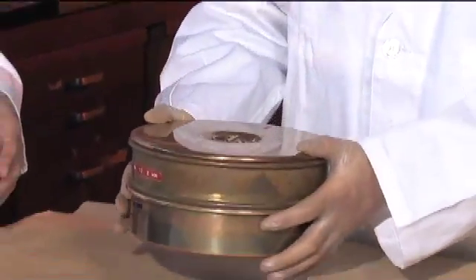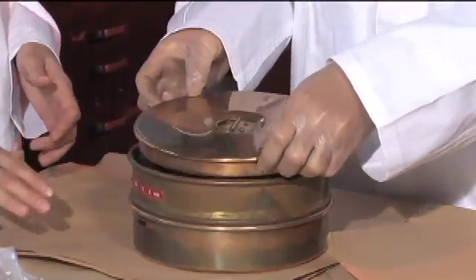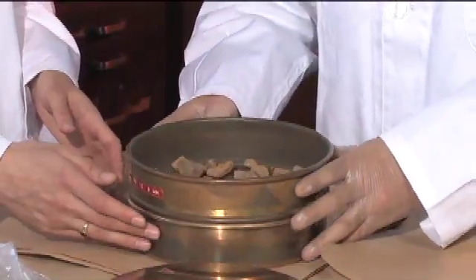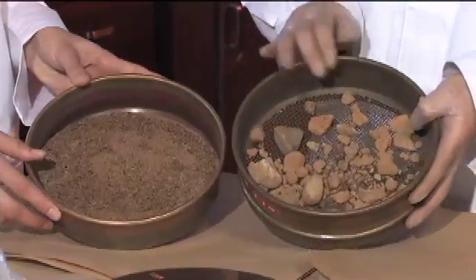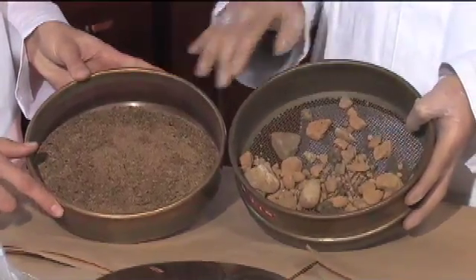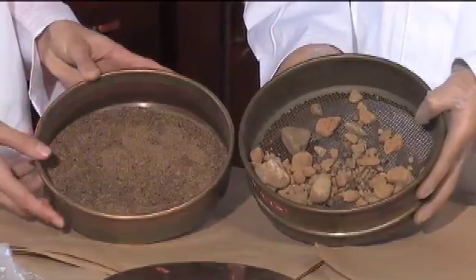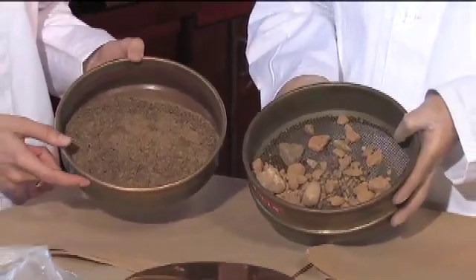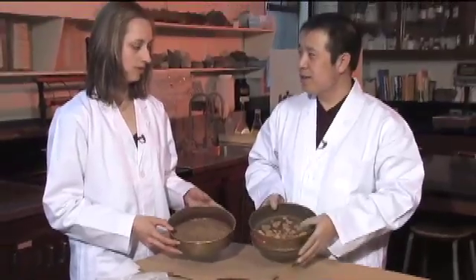We are almost done. It sounds like all the fines have gone through after shaking for a while. Let's have a look. Now you can see the coarse material on top and the fines below. We've got all our large rocks still on top and everything smaller than two millimeters has gone through to the bottom. Now let's collect the coarse material first.